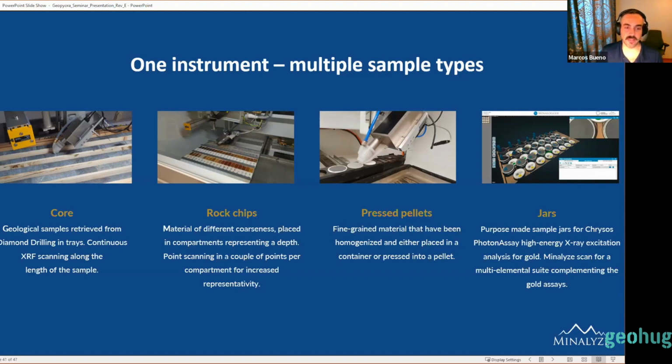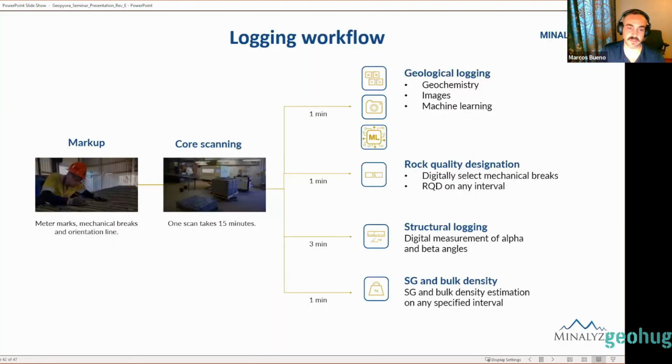So the idea is that we would of course scan all the core, and that would help us, already before testing, to understand and domain the core into different textures, different mineralogies. Then we'd be able to select a large enough number of samples from these domains identified by core scanning, to have a really good understanding of the hardness by doing Geopyörä tests on those samples. And then later we can infer the data for other sections of core that have been scanned.